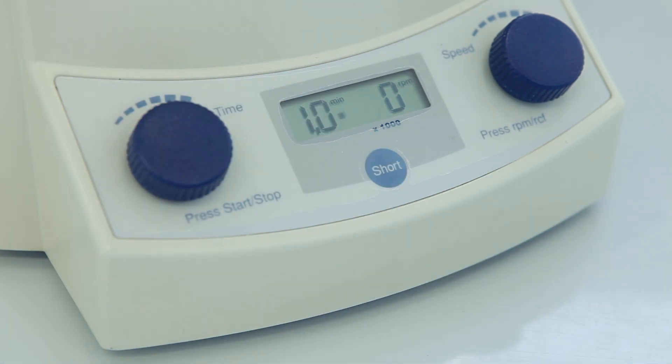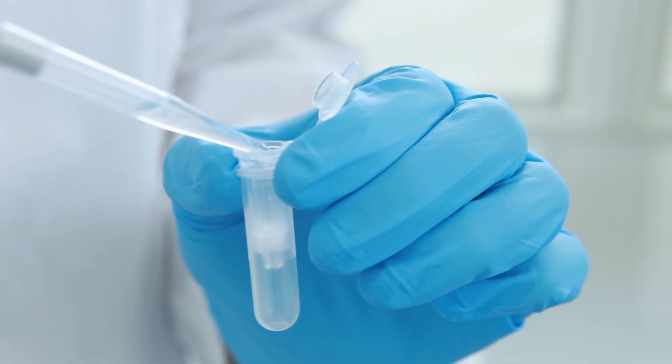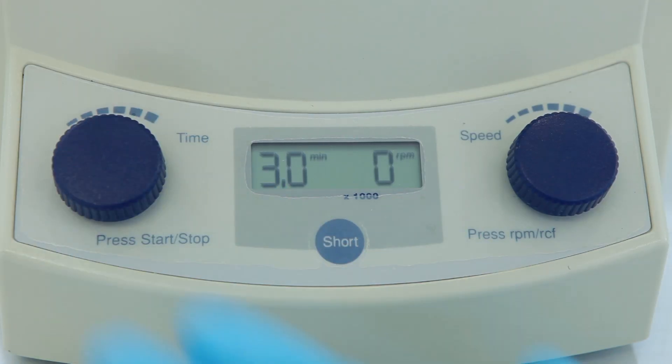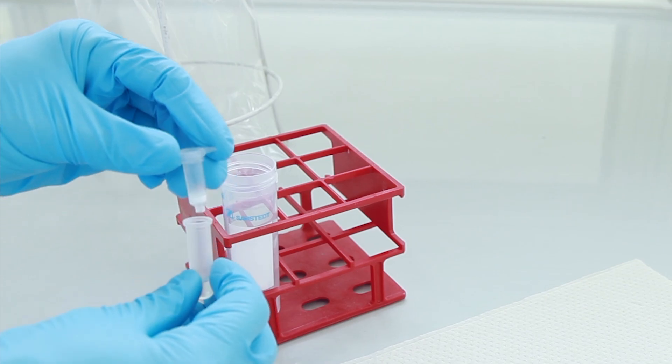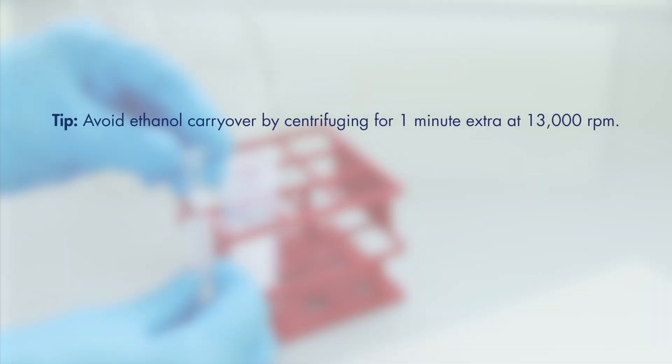Discard the flow-through and collection tube. For the second wash step, use 500 microliters of buffer AW2. Centrifuge for three minutes at 13,000 rpm. Discard the flow-through and collection tube. For optimal results, try the following tips to avoid unwanted ethanol and salt carryover: discard the flow-through, reuse the collection tube, and centrifuge for a further minute at 13,000 rpm. Make sure that buffer AW1 is added before buffer AW2. Buffer AW2 should be used at room temperature.